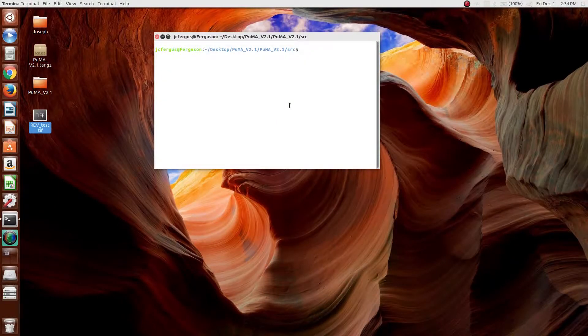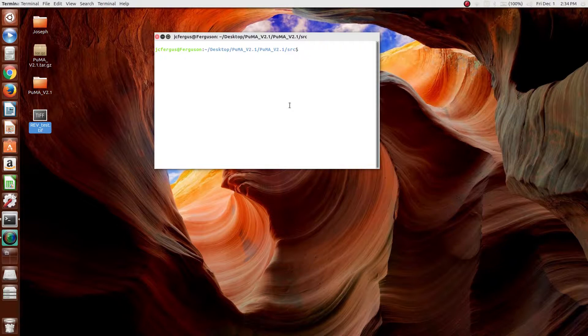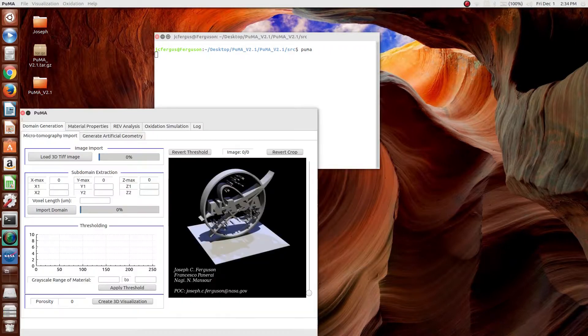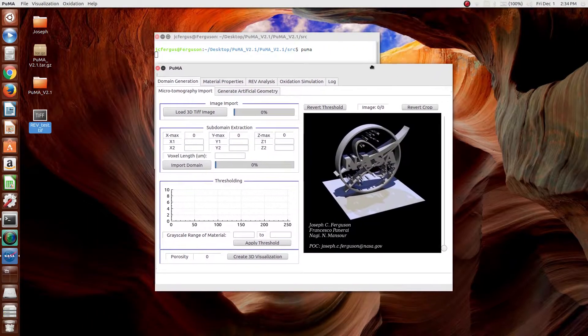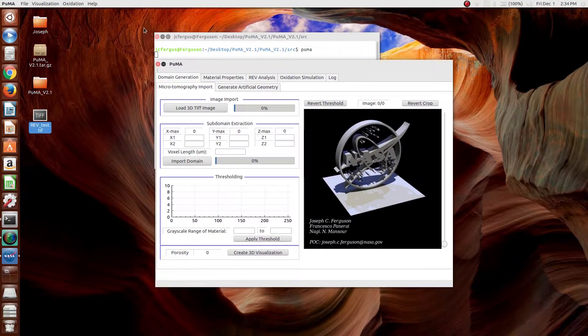In this video, I'm going to go over the instructions for doing representative elementary volume analysis in the PUMA software. Assuming the installation has been complete, PUMA should be able to be run by typing in PUMA from any terminal, after which the PUMA window will appear.